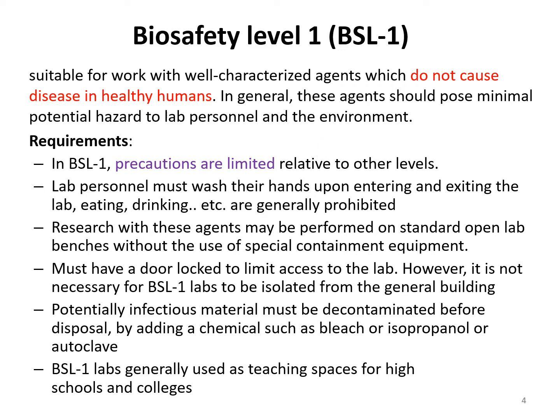What are the requirements and lab facilities we need to work at biosafety level 1? The precautions are limited relative to other levels, because this is the basic level. Lab personnel must wash their hands when they enter or exit the lab.